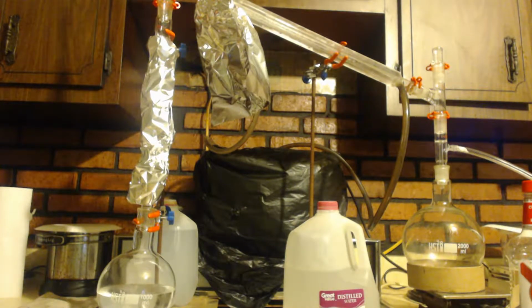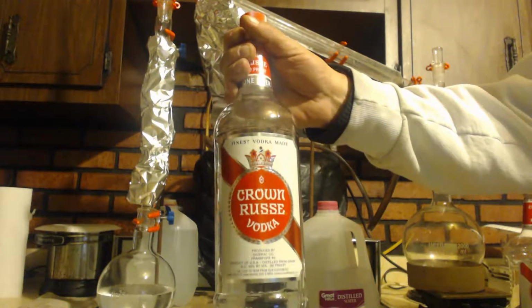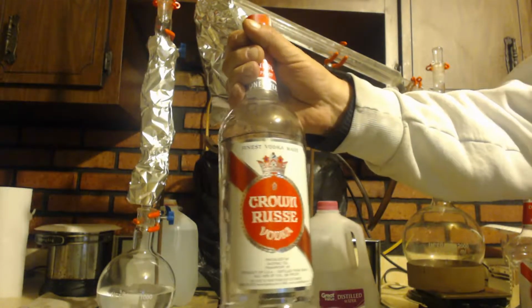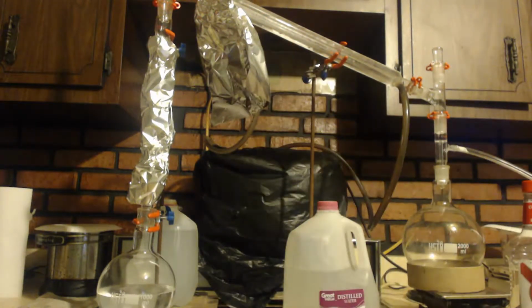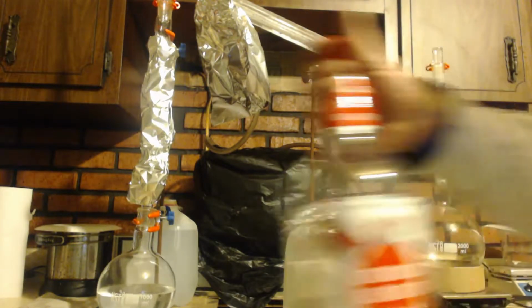Now, I did a video called How to Get Anhydrous Ethanol, and how-to-get videos are just talking about how to get it. This one, I'm actually doing it. Basically, I got four of these 1 liter, 40% by volume vodka bottles. Got four of them. Distilled them out. And that got me this.